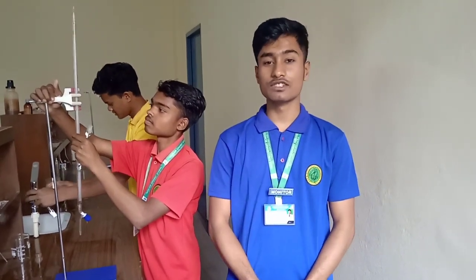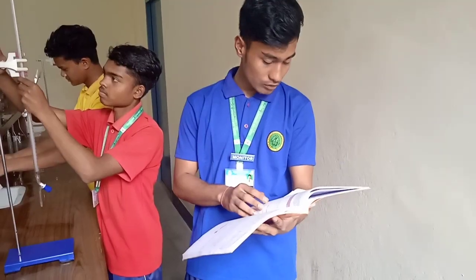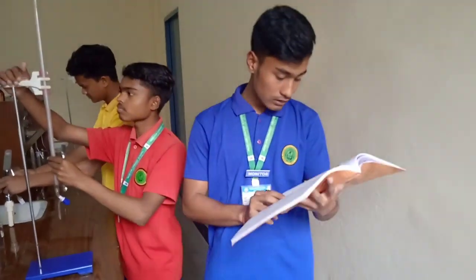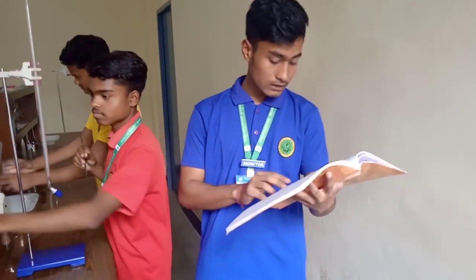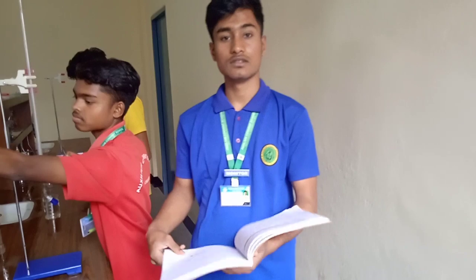Hello everyone. I am from Auxilium Convent School, New Champa, and today I am going to demonstrate an experiment to prepare 250 ml of standard solution of N/10 or M/20 oxalic acid, taking pure crystalline oxalic acid.